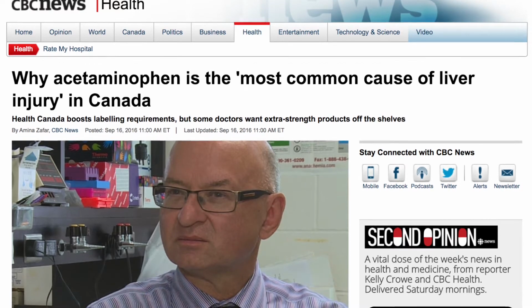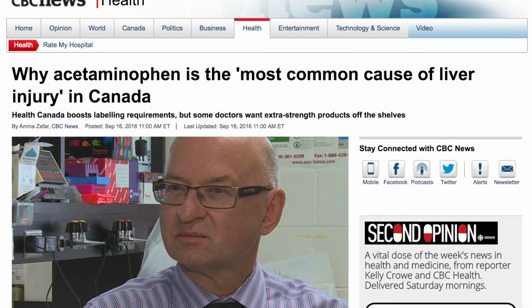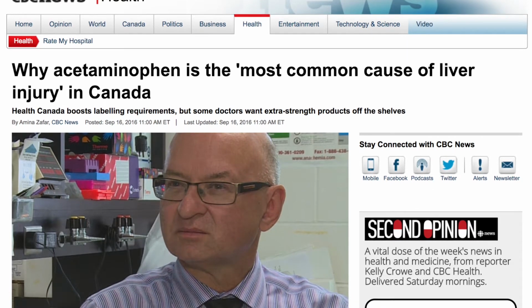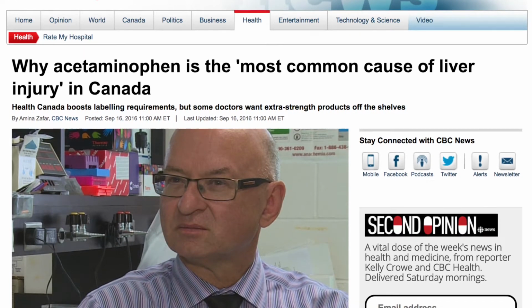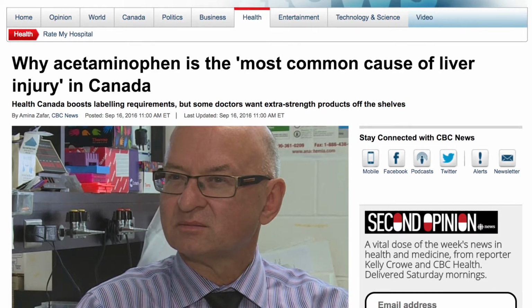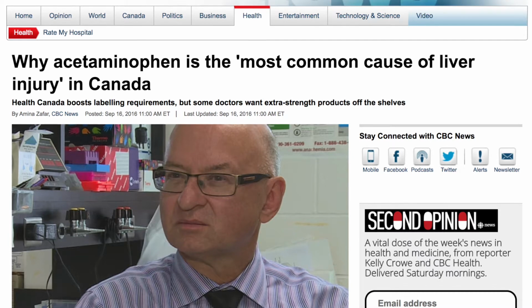One possible issue with our lab was that the medicines we used were old, so they may have changed their properties over time. As well, the medications were made for kids, so they weren't as strong as typical Advil or Tylenol pills. We also failed to monitor the amount of oxygen produced over time and just measured it at the end. This could have impacted our results, and we didn't collect as much data as we could have.